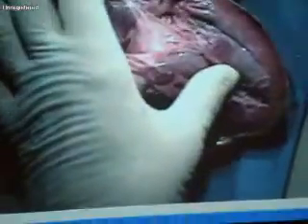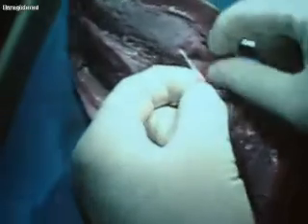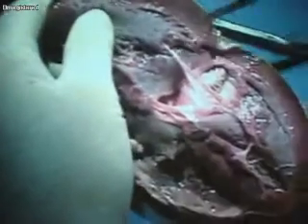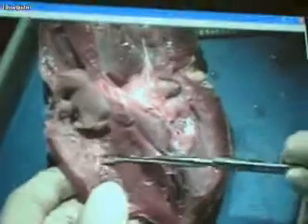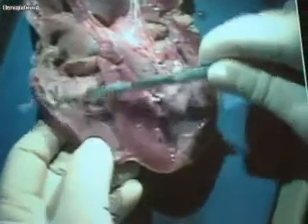If you stick your hand into both sides and feel towards the middle, you can sometimes feel a really thin spot that used to be the foramen ovale. But on this one there's just not enough atrium left. If I look on the left side, we have a lot of atrium left, so we're going to look inside there. Here's that pectinate muscle of the left atrium. Do you see where these chordae tendineae are attached — how it sort of forms nipples in the muscle? These are the papillary muscles attaching the chordae tendineae to the bottom.